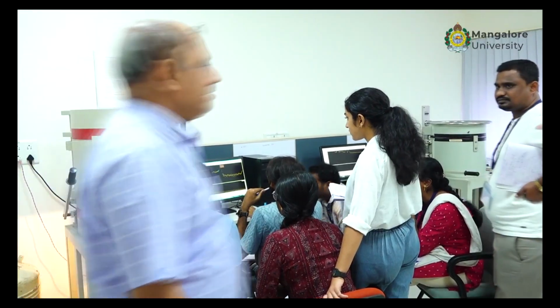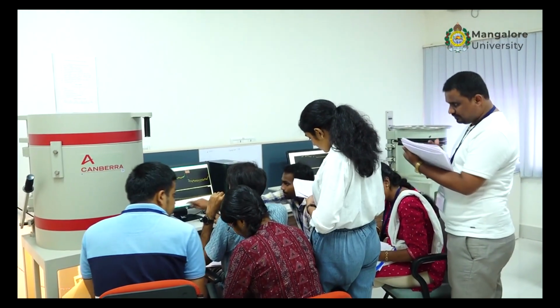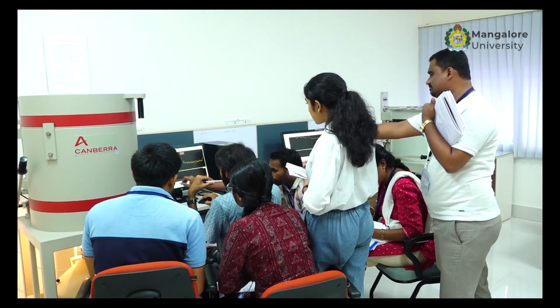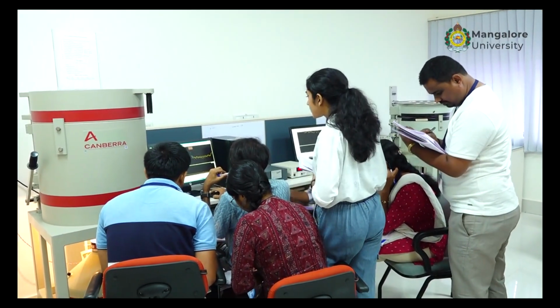This second batch, sir. Identify material, radionuclide identification. Same, sir. What is the first year code? Swipe, sir. Swipe all around the radionuclide.